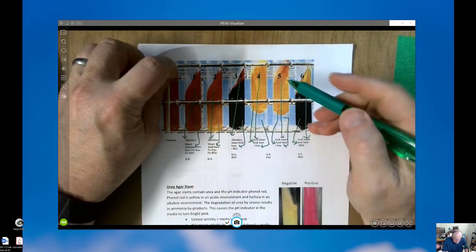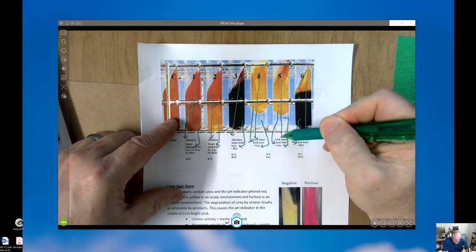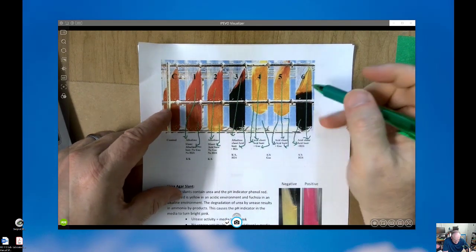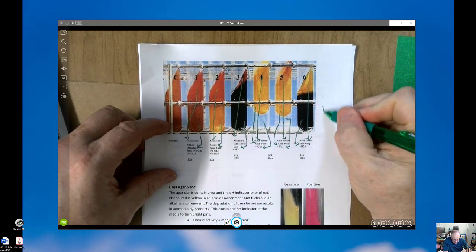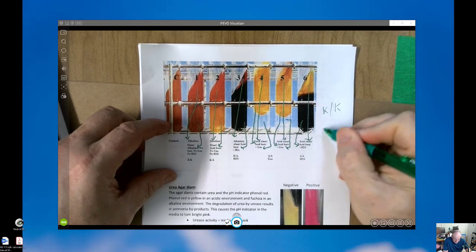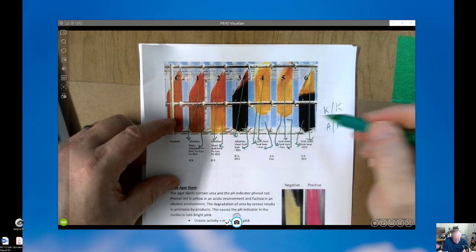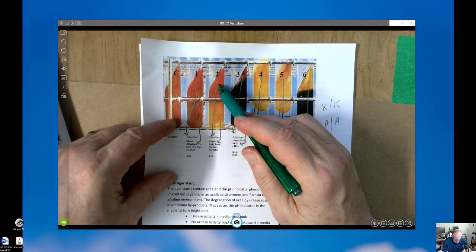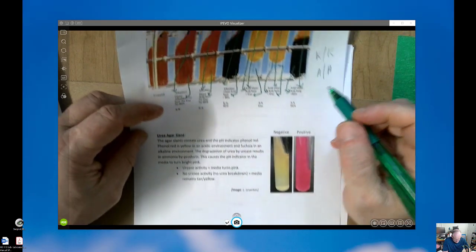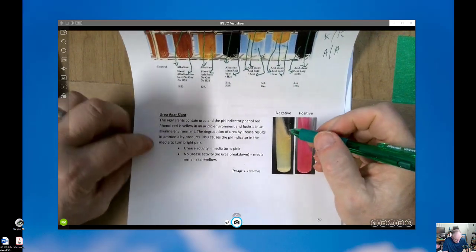And this crappy picture is just identifying some of the characteristics of the acids and the various characteristics so you can get the nomenclature of the K and the AA and that sort of thing. But the harder ones perhaps are the gas and the non-gas, but here's a KA for an example. So you can look at that. Sorry for the quality on that.